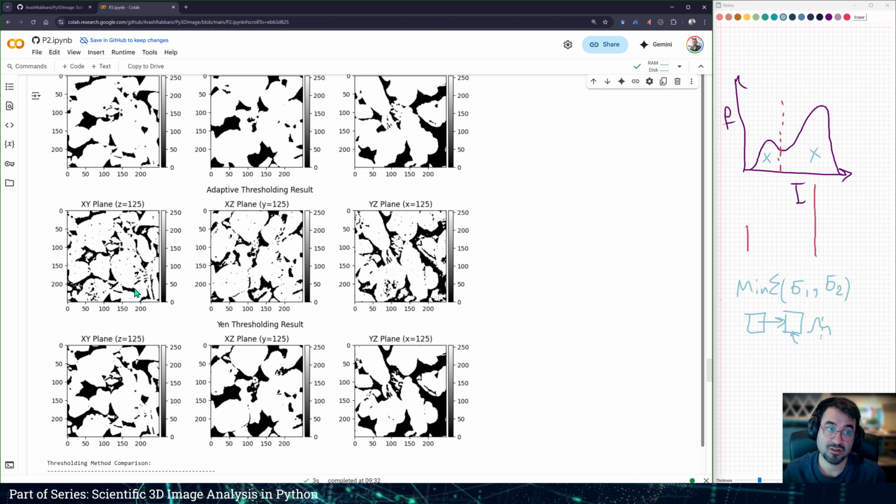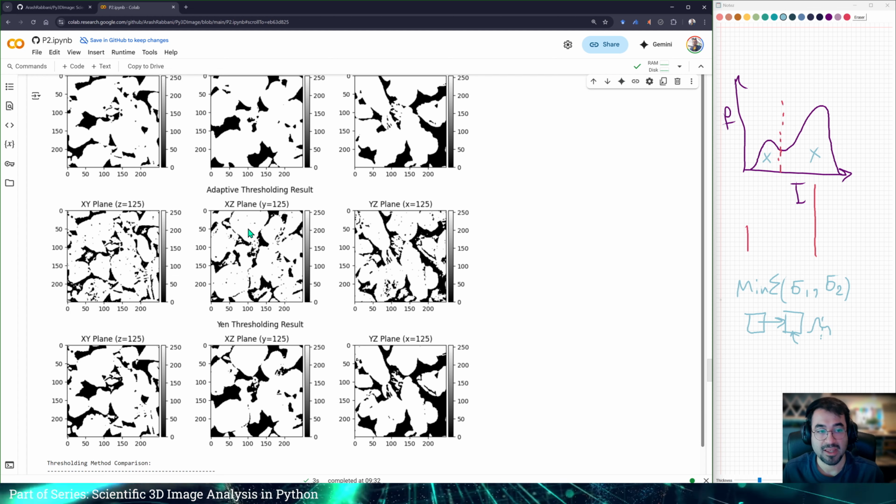And if they're not, you need to consider a threshold to get rid of any details beyond a certain level using the filtering methods that we talked about. Combining filtering with thresholding is actually a very good practice. What I'm curious to see is what would happen with these very tiny little spots you see here if we do a median filter before this. That is a good thing for you to do as practice.